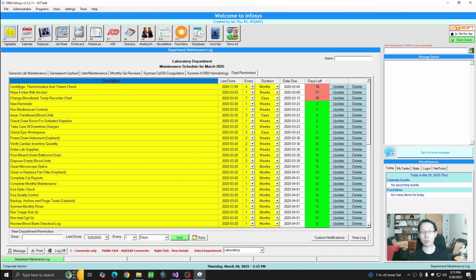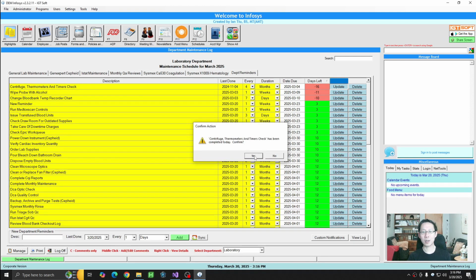If I say I did my quarterly, or rather every 4 months, check on the centrifuge, thermometers, and timer check, I just need to update and then say yes.